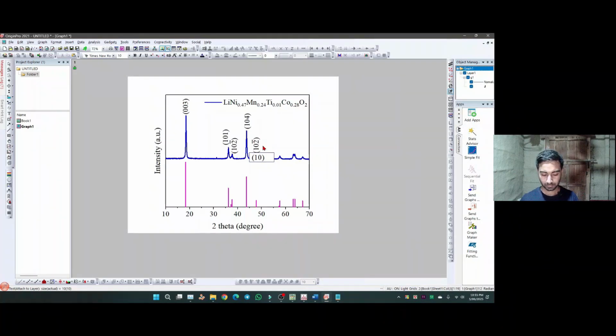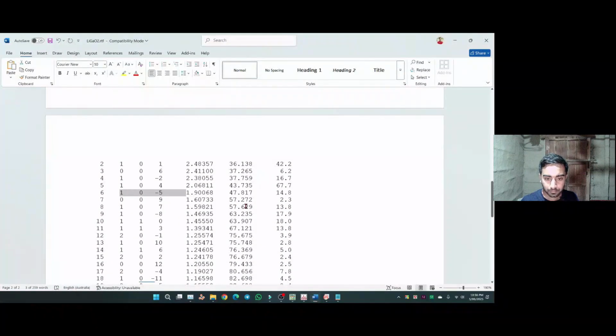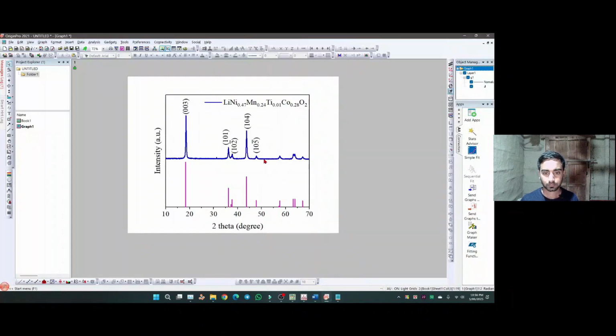Sorry, 5 bar. Okay, fine. Now 57.62. This is 107.